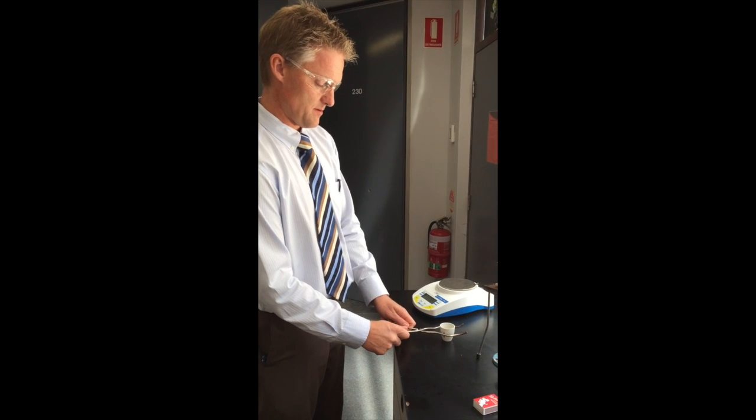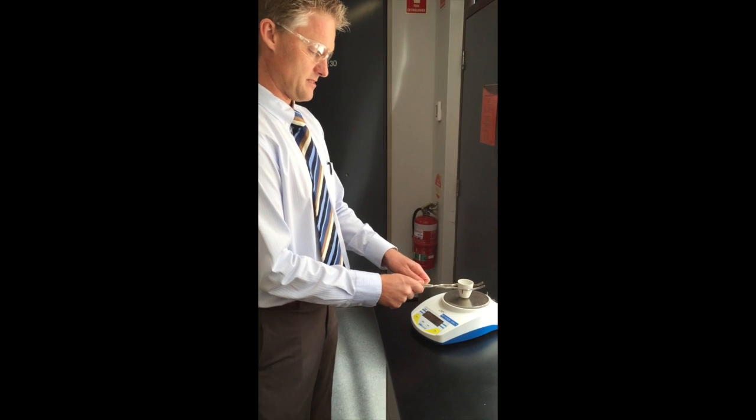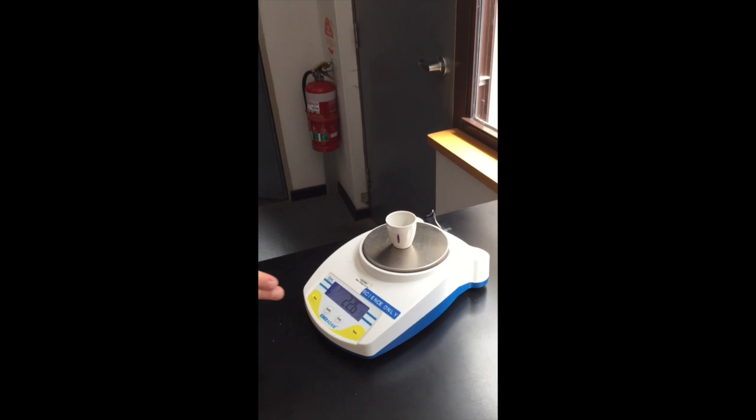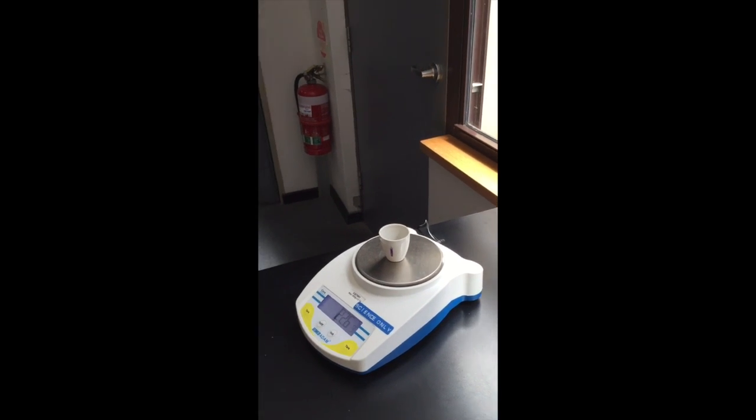Once it's cooled down a bit more, carefully place it on the balance to weigh it. You can see only a very small amount of organic matter remaining in the sample, but there is still some organic matter present.